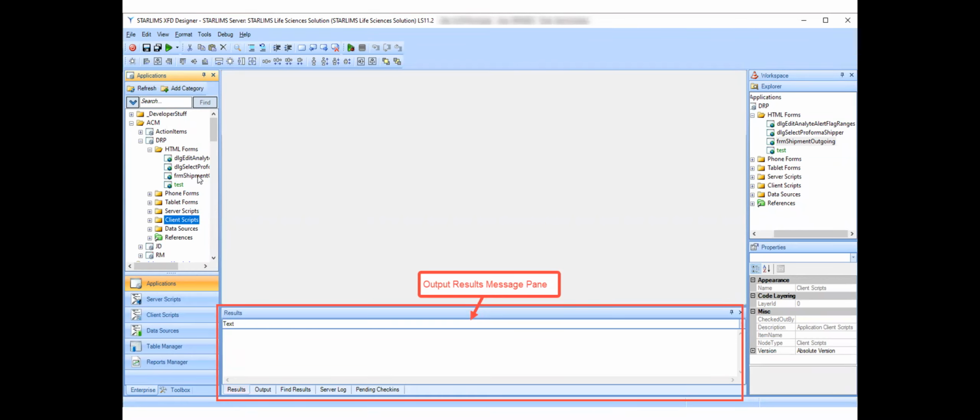Okay, so moving on. After finding results anywhere in the system, they'll appear down here in this area. So when running an application in your design environment and debugging it, there will be many instances, I can tell you firsthand, whereby what you think would be working isn't working for some strange reason, and you'll get some ugly error on the screen. You'll learn to read them, you'll learn to understand them, and the main tool to do that is to go over to this server log area. I can use my little laser pointer, right? Yeah, the server log area.